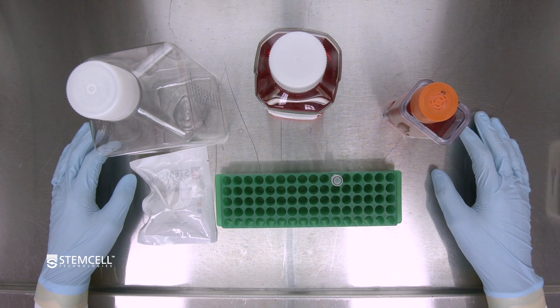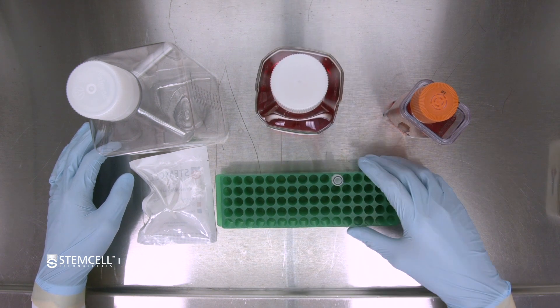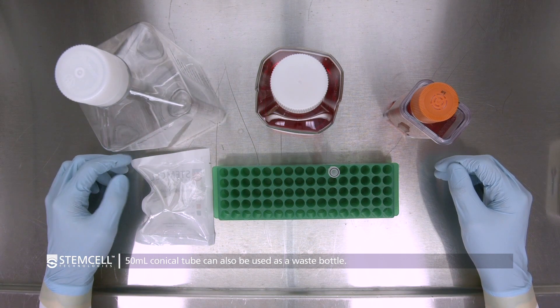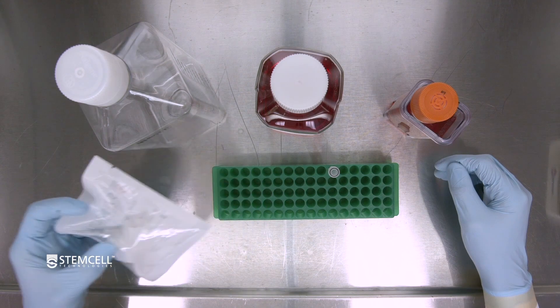Here are the materials required for a 50% media change: StemCell TeSR AOF 3D basal media, warmed to room temperature, a waste bottle, and a large 37 micron filter to collect any aggregates in the spent media.